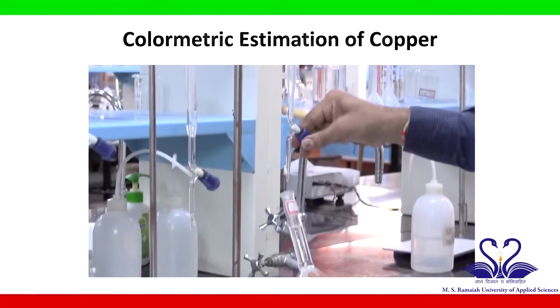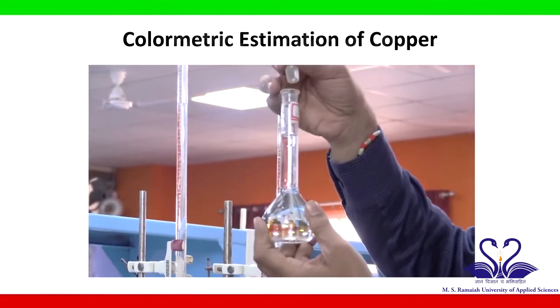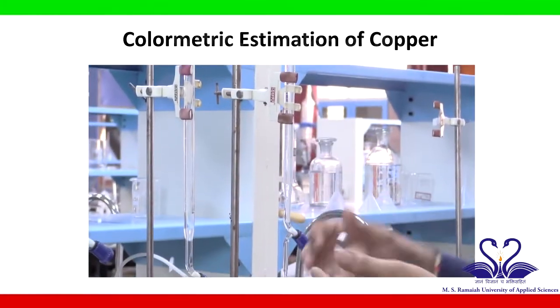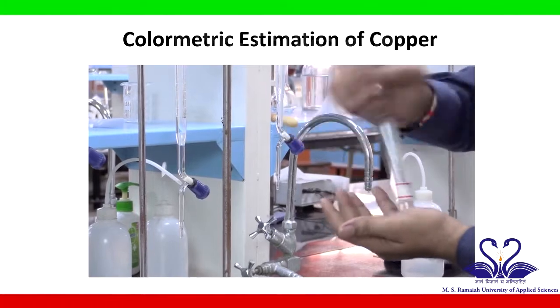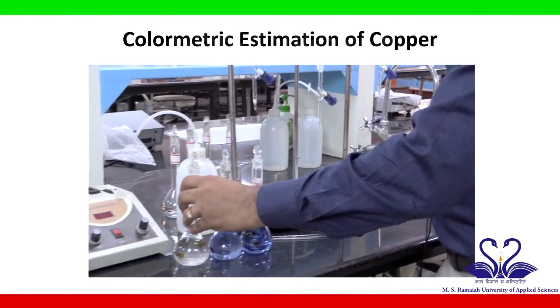So, 2 drops. So, the blank solution is ready. That also should be shaken uniformly.